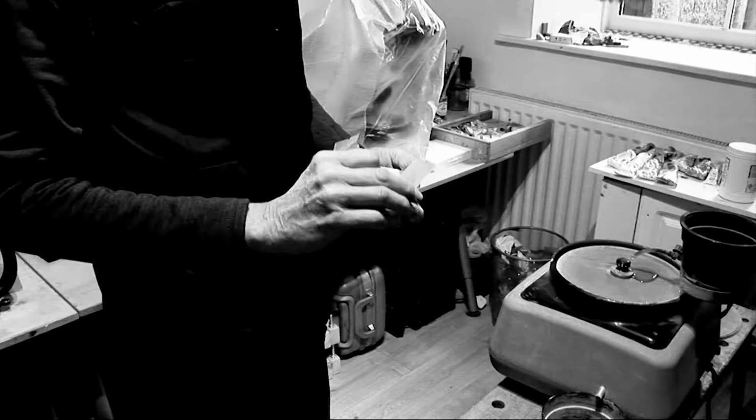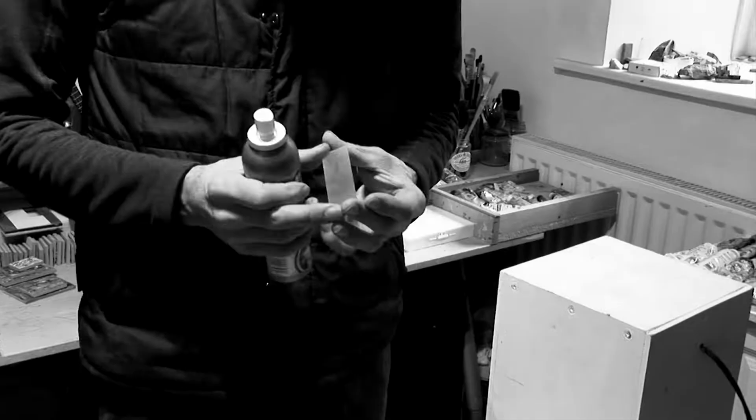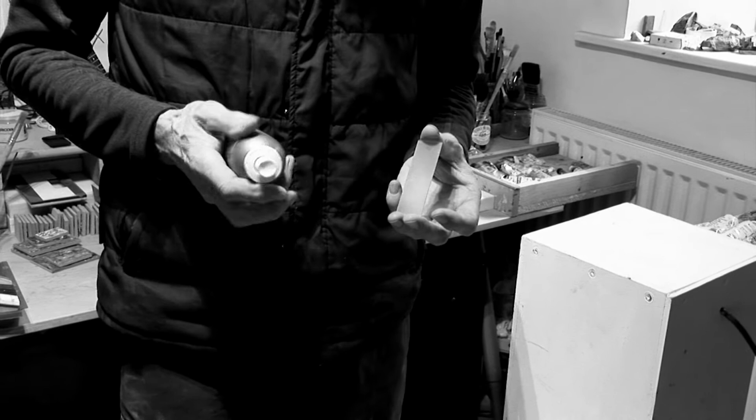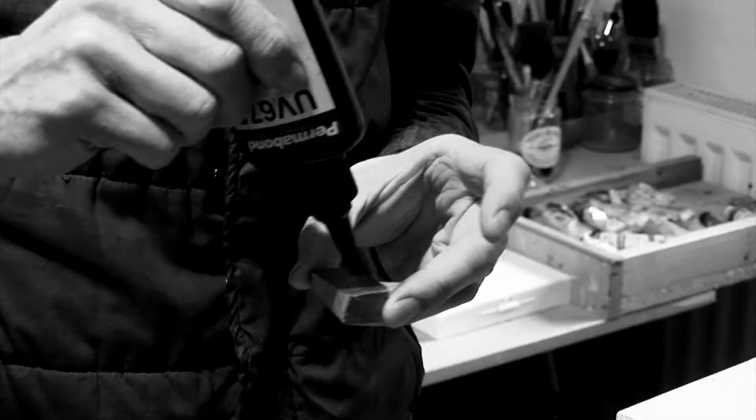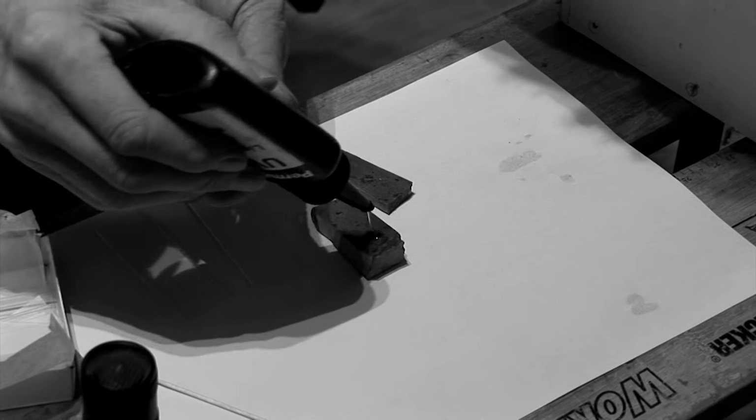So there's the slide. That one's slightly frosted. The rock has got to sit perfectly on that. Clean it, make it nice and clean with some isopropyl alcohol. Get any grease off it. This is UV glue, which is liquid until you shine a UV light on it and then it goes solid.